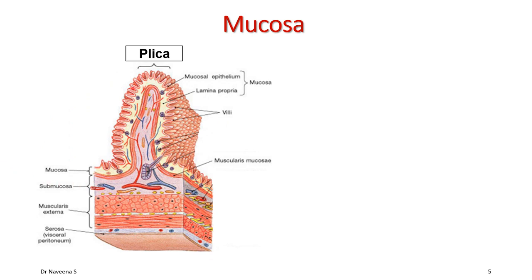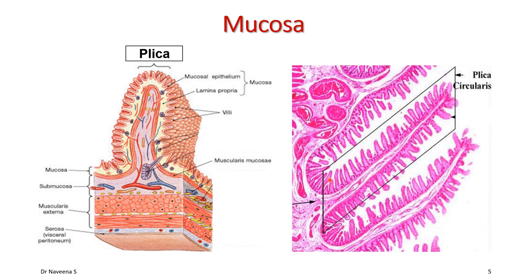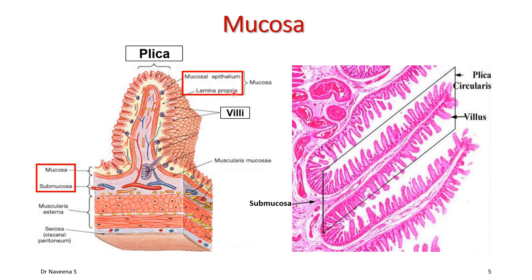Focusing on one plica circularis, the H&E stained tissue shows that each plica is actually formed by an underlying submucosal projection into the lumen, so that the mucosa covering it is thrown into a fold. Each plica is composed of mucosa and submucosa seen in its center. Further, the epithelial layer of mucosa is thrown into folds by underlying lamina propria projections; such projections are called villi.